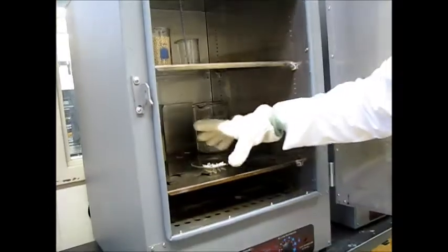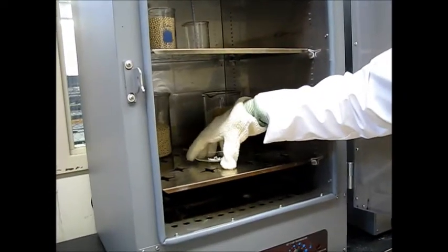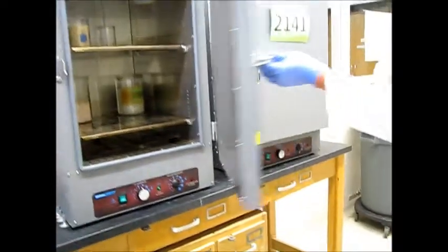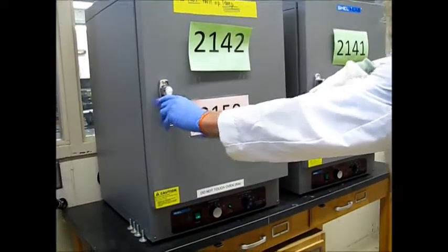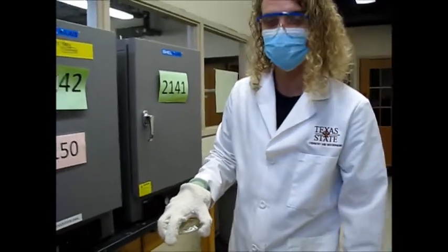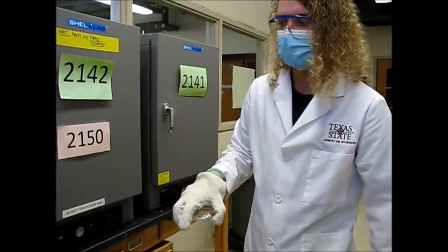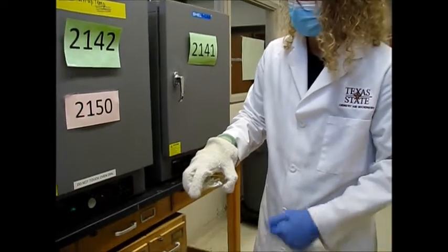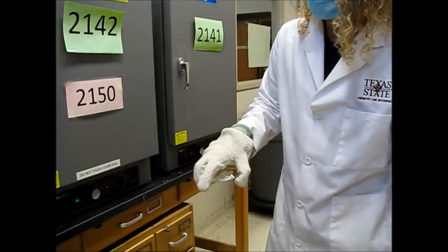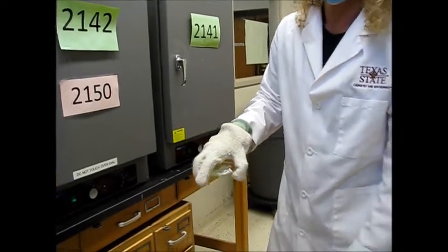So our product here looks nice and dried out. Go ahead and grab it like this. Close the oven. Before we get a mass for this, we need to wait for the watch glass to cool down, or else we might get an inaccurate reading for the mass. So we're going to set this down outside and just let it cool down, and we'll record the mass once it's cooled down.